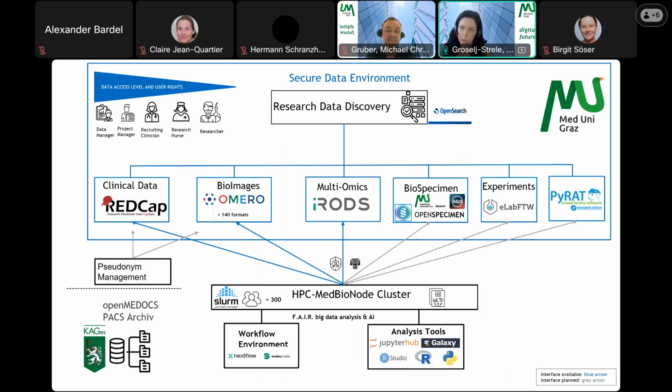Assume you have your research question. You want to find out, is it necessary to go into a prospective study, or are data available? Therefore, you need your data management systems, and data must be connected, searchable and findable.